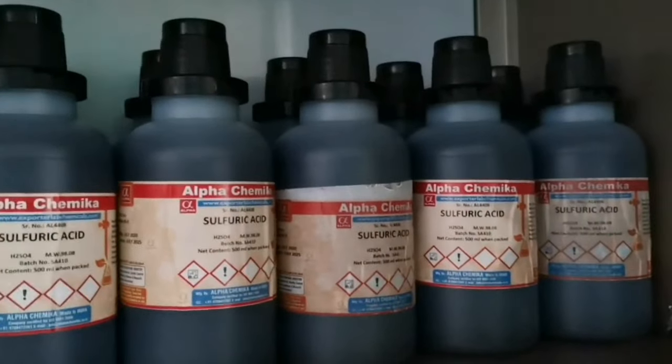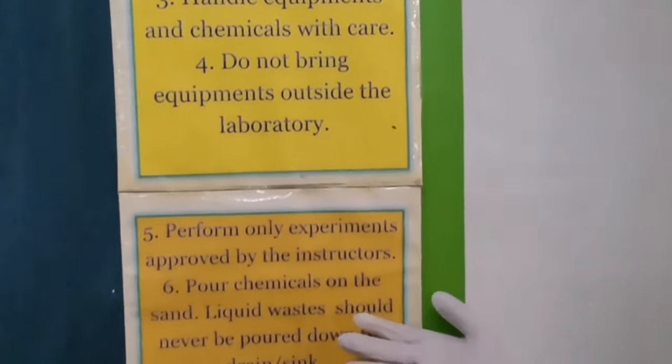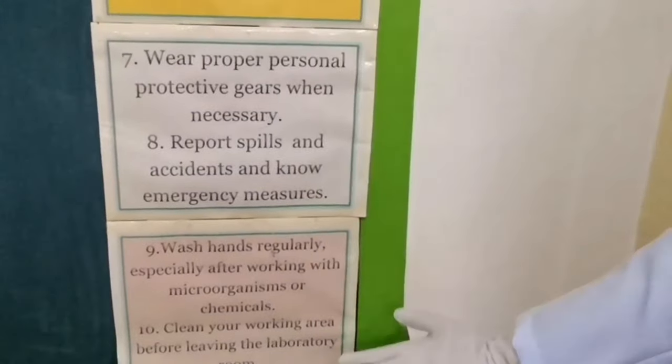Minimize all chemical exposure. Assume that all chemicals of unknown toxicity are highly toxic. Following these important rules will help make your laboratory experience safer and enjoyable.